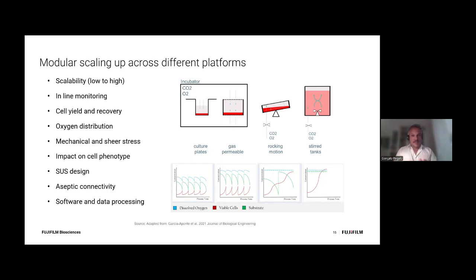But from a biological standpoint, a top-down gas distribution is actually quite limiting, particularly for T cells. And this becomes particularly challenging if you remove that serum, an extremely rich, extremely diverse source of nourishment and growth factors, right? If you remove that, those elements become a little bit tricky.